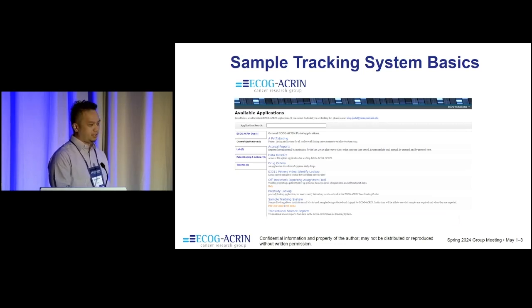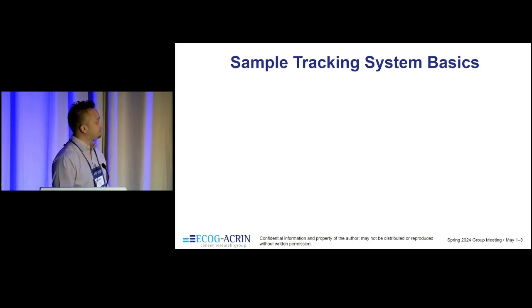So just a couple pointers referring to this site here. We're going to focus specifically on the sample tracking system, which can be found right there. And right there, this is the STS user guide. It has step-by-step instructions for how to log samples, in case you have any questions and any errors or issues you may run into. You can just go ahead and click and download there. It's a PDF, and it also contains images, which is very easy to follow.